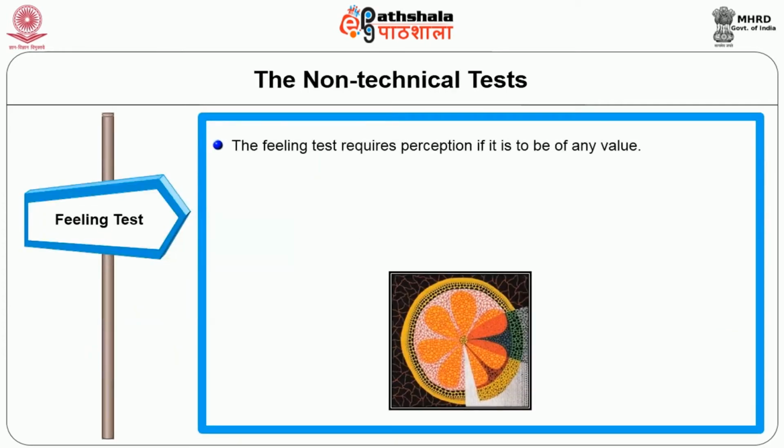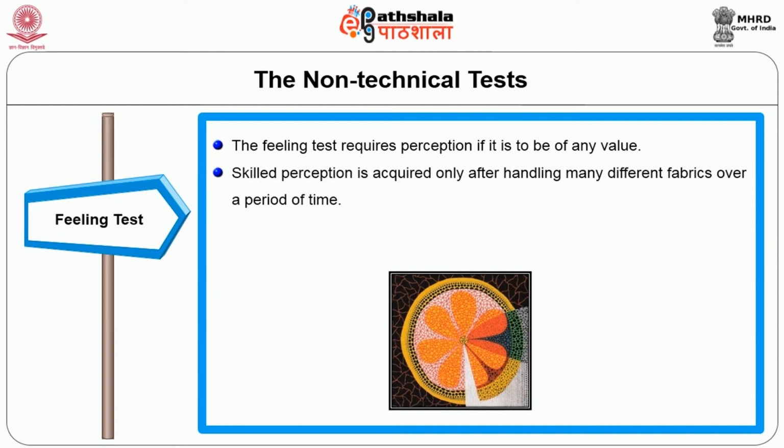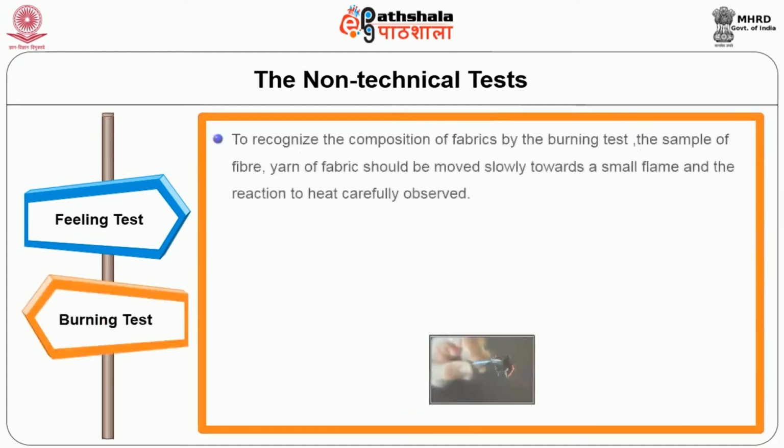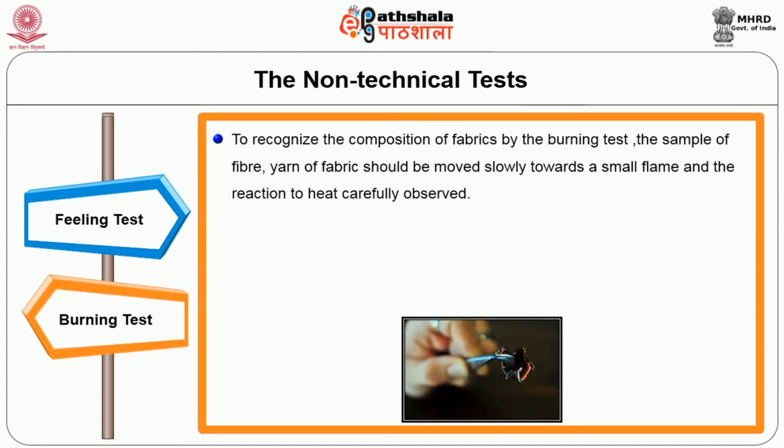In case of non-technical tests like the feeling test, the feeling test requires perception if it is to be of any value. So it requires a skilled and experienced operator. Skilled perception occurs only after handling many different fabrics over a period of time. The limitation of this test becomes apparent when examining and comparing fabrics of different fiber content. On the whole, the feeling test does not give quite confident results, so it is not a confident test. Next we are going for the burning test.